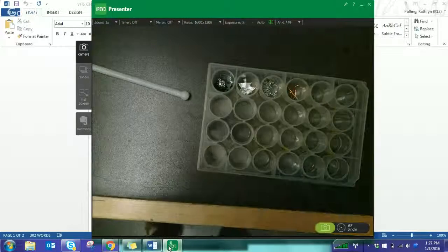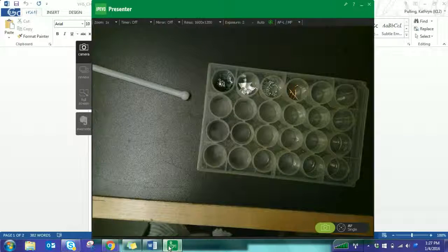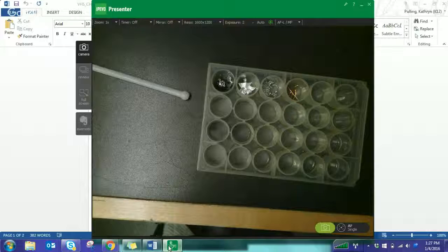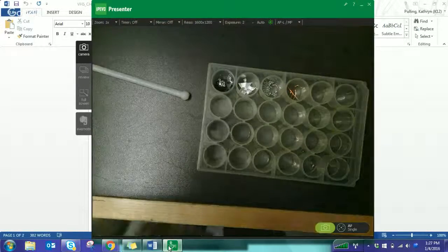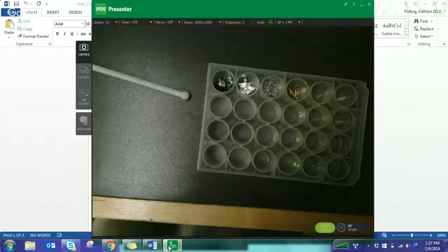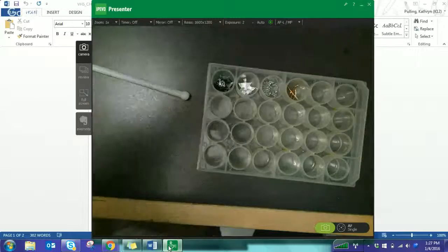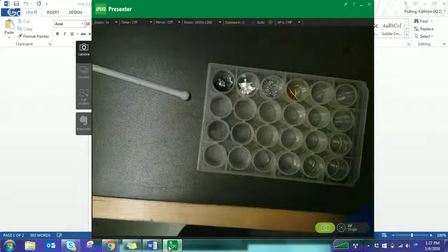The procedure says to use 25 drops. We were using 10 drops in the last lab, especially since I know we need the sodium hydroxide for the next lab. I'm going to do 10 drops of each just to conserve it, okay? But our first one, we'll keep going on these until we get a reaction.